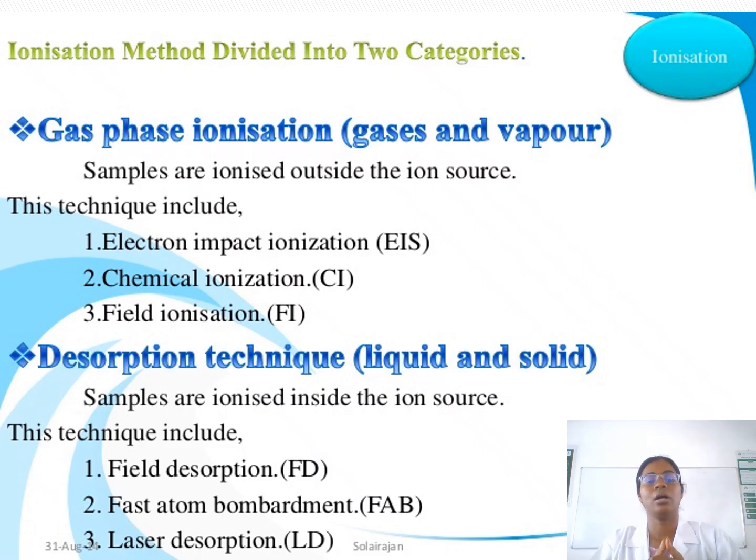The second one is the desorption technique. In case the sample is liquid or solid, we choose the desorption technique. What are the desorption techniques in the ionization chamber? They are field desorption, fast atom bombardment, and laser desorption (MALDI).